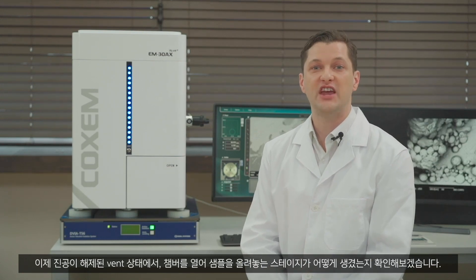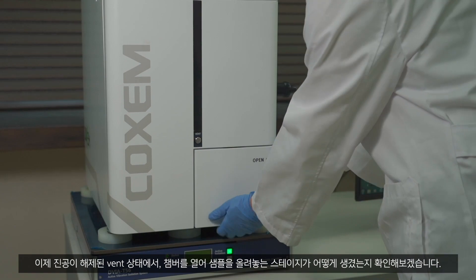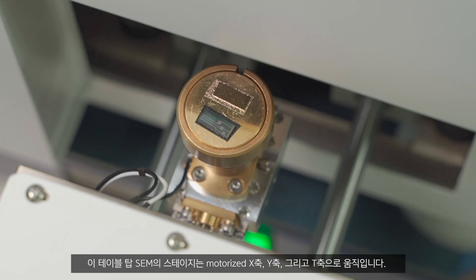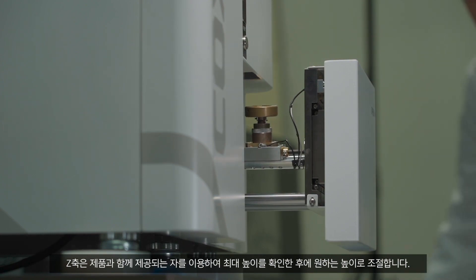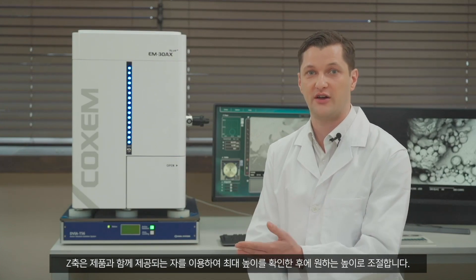Now let's open the chamber in vent mode with the vacuum turned off to take a look at what the specimen stage looks like. The stage of this tabletop model moves along motorized X, Y, and T axes. You can adjust the height of the Z axis manually as needed after checking its maximum height using the ruler that comes with the product.